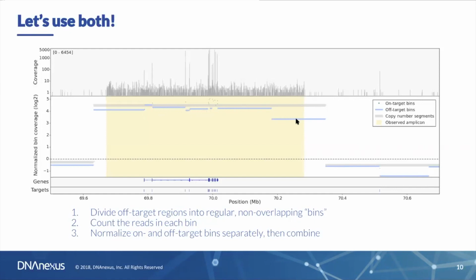They track pretty closely, and this is without performing any additional normalization. So this is a very strong signal. We see that the coverage right at the edge of this falls off a bit. That's because it's averaging both the amplified region and the neutral region. And that's just a signal that we're working with more coarse-grained information. And so we have to take that into account.